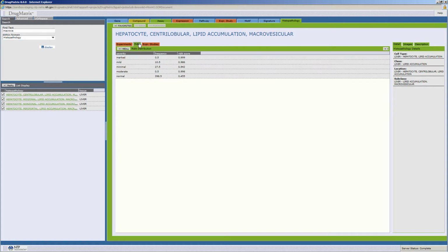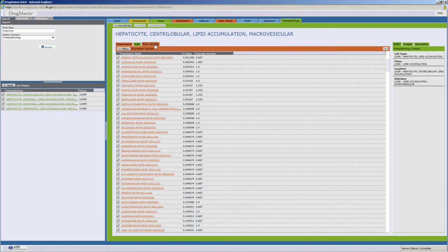And there's extensive documentation to explain all of these statistics and things along those lines. And you also have, when you go into expression studies, this is the entire study. So did a chemical at any time point in a given study produce this phenotype? And if you need to, you can export these. Just go here, export, and it'll export as an Excel spreadsheet.